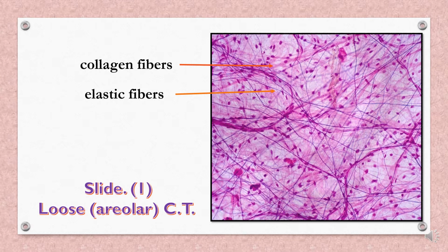Also containing reticular fibers، لكن هنا ما ممكن أنه نشوفه لأنه مثل ما ذكرنا يحتاج إلى special staining. The most common type of the cells are fibroblasts. تلاحظون هذا الفايبروبلاست it is widely distributed in this tissue اللي هي تعتبر most common type of cells in this type of tissue.